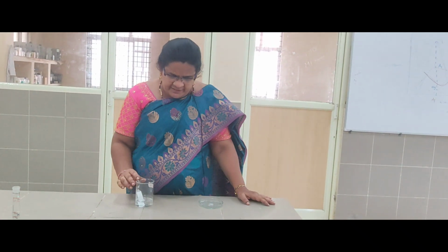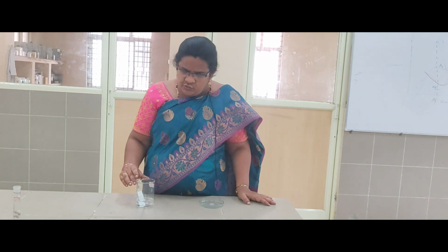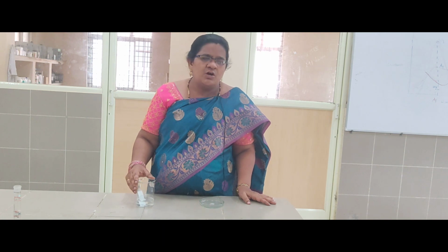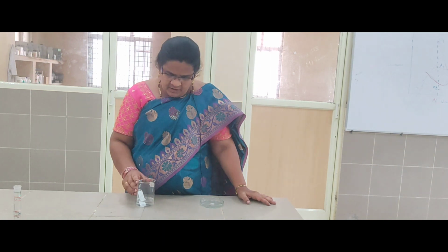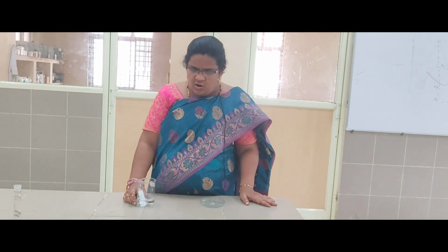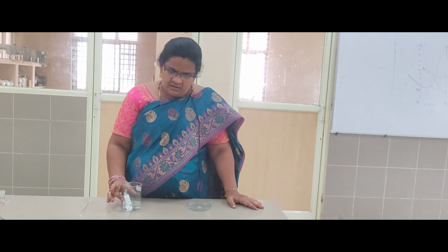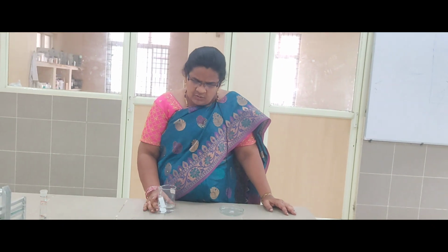The principle here is that the mobile phase travels upwards against gravitational force by capillary action. You have to observe the solvent front, which means the point the mobile phase has travelled up to. When three-fourths of the plate is wetted, we have to stop the practical.